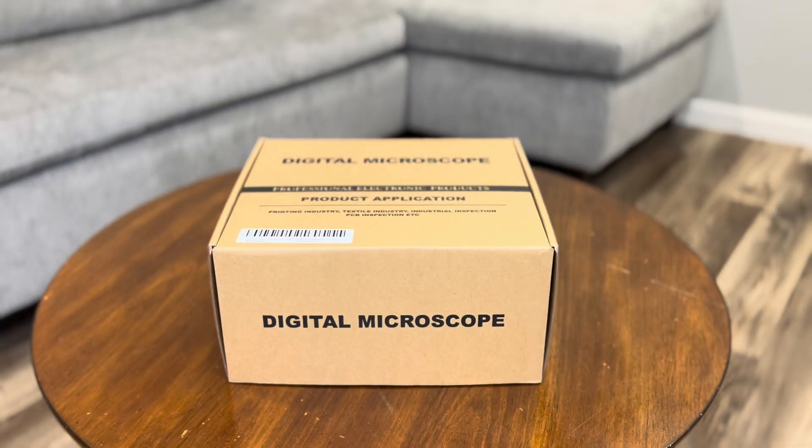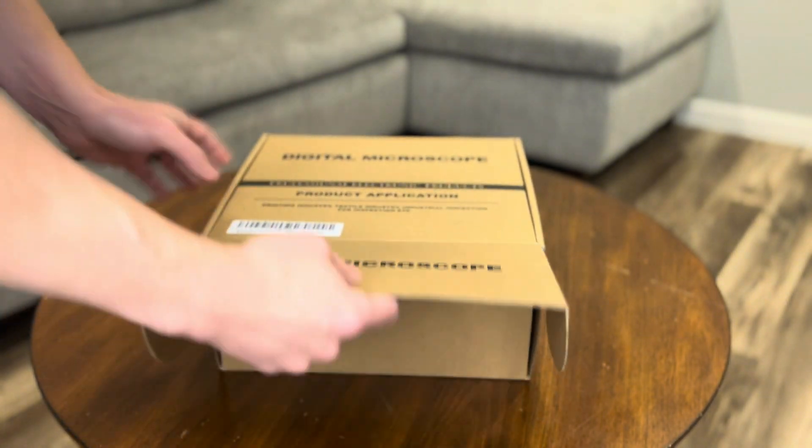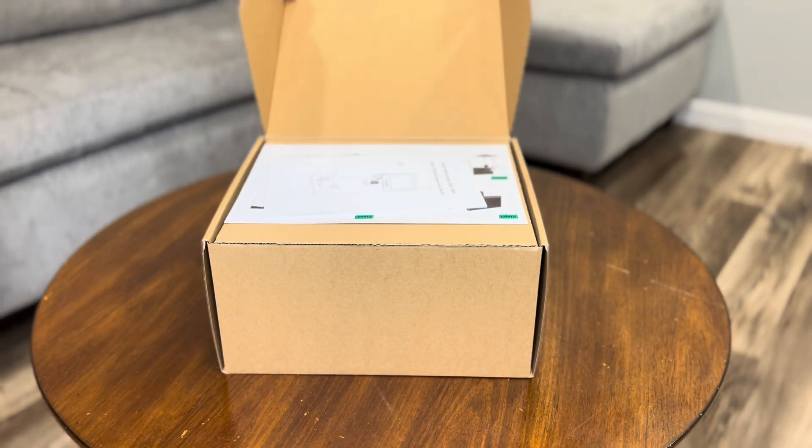Alright, let's jump into the unboxing. The Joya Lens Digital Microscope comes in a sturdy, well-packaged box. Let's see what's inside and check out what you get right out of the package.